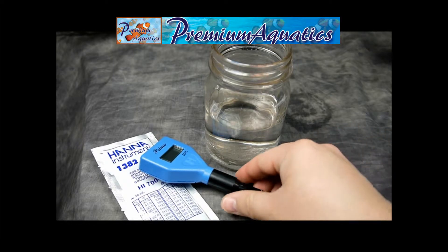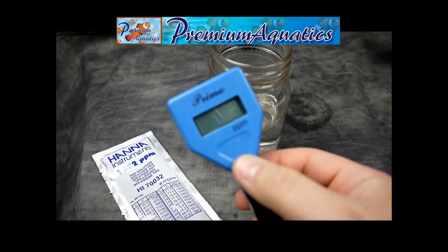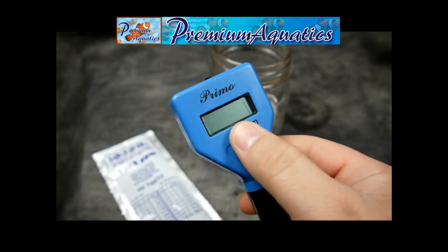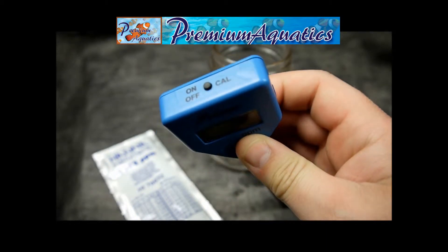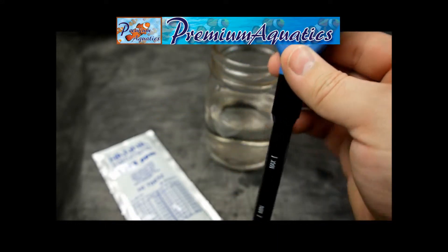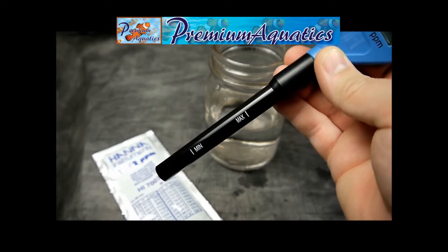Here we have the Hanna Instruments TDS Meter, or Total Dissolved Solids. This unit measures in ppm on this nice LCD screen. On the top we have our on/off calibration button all in one. On the back is the battery. And then of course we have our probe with our minimum and maximum lines to submerge in the water.